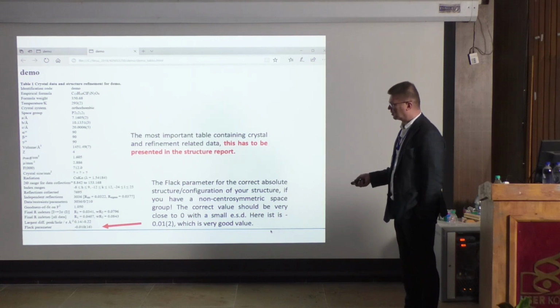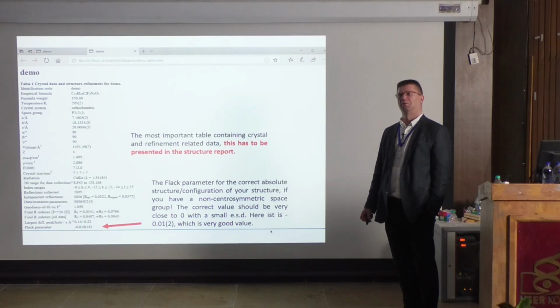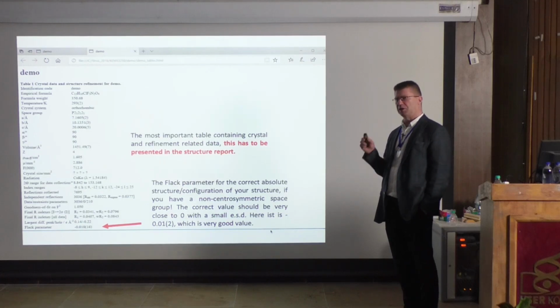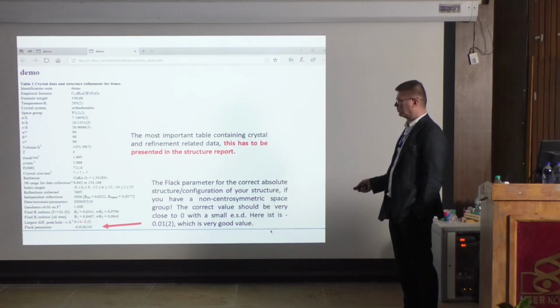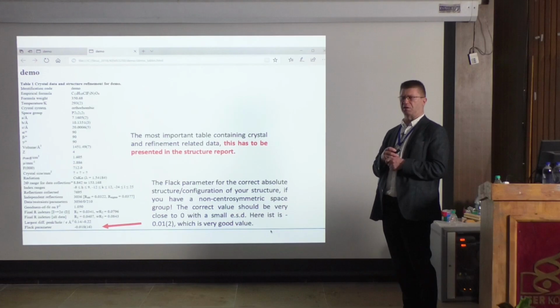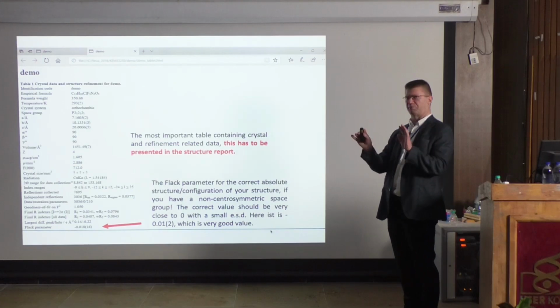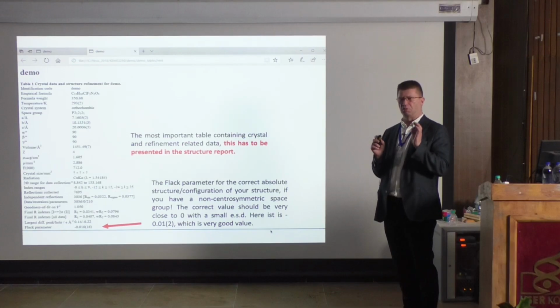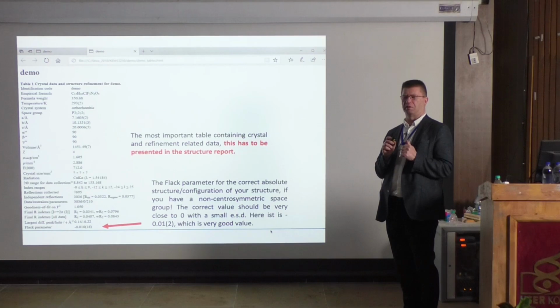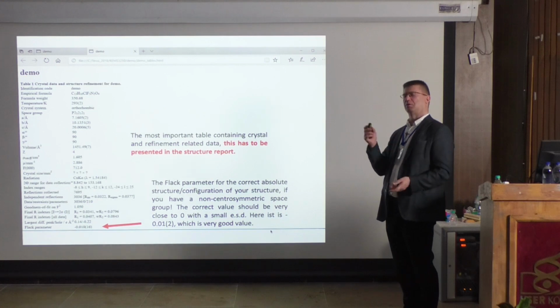This calculation is very complicated if we have a hydrocarbon, but it can be done with a very specific technique, so that we can also get the handedness of a hydrocarbon. But as I said, X-ray diffraction, based on the Flack parameter, based on the difference between the data, is the only experimental method where you can say for sure, okay, my molecule is left-handed or right-handed.